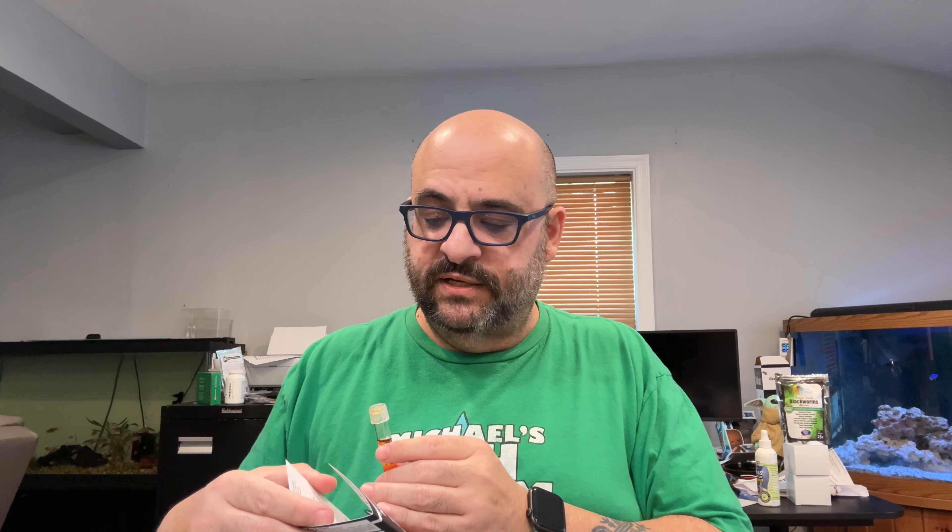All right, let's do the pH again — only three drops this time. One, two, three. But folks, the bottle is dripping out the side — there's a hole in it. I can't get the right amount, which means this test is going to be invalid no matter what. I need to call the company and see what's going on because this is definitely not right.